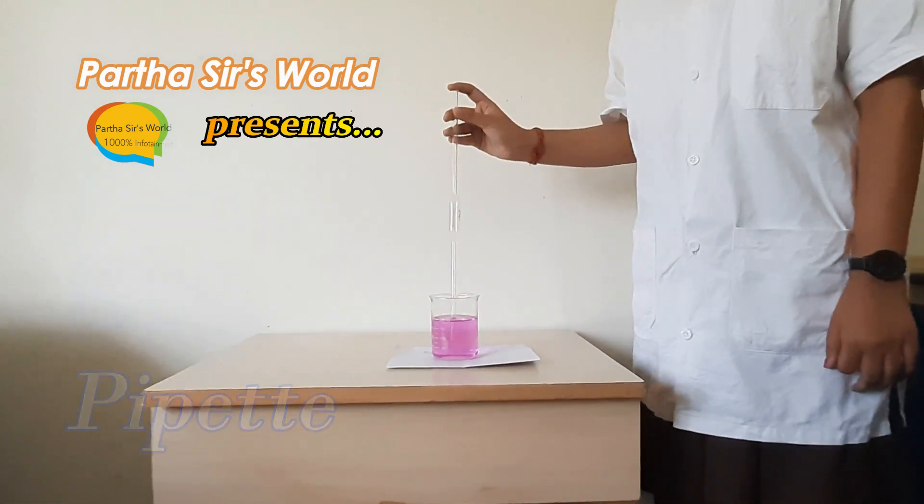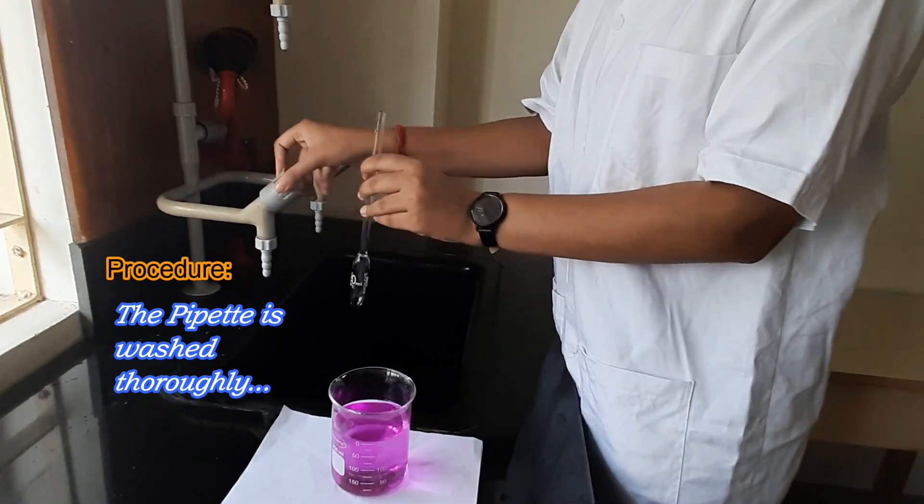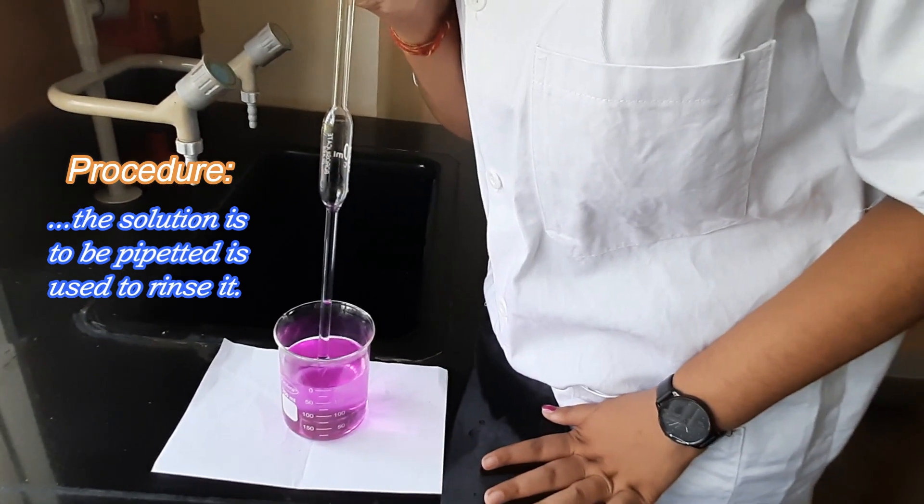Using the pipette: the pipette is washed thoroughly and the solution to be pipetted is used to rinse it.